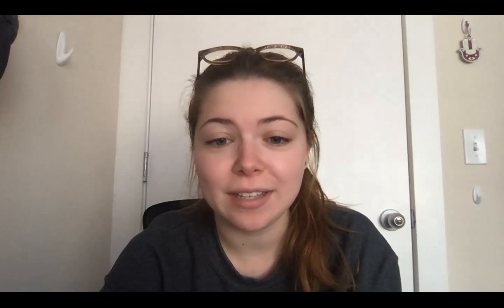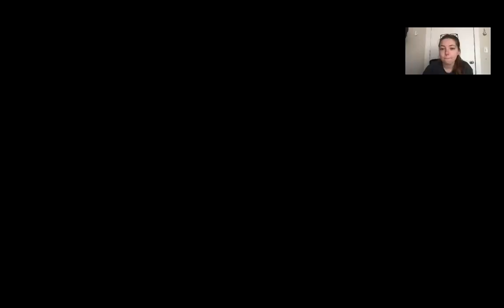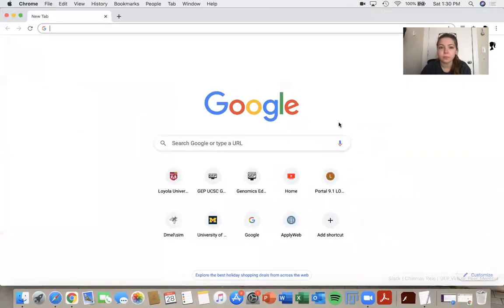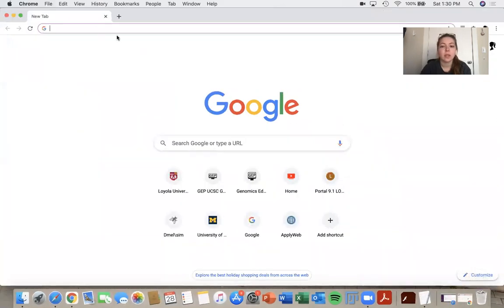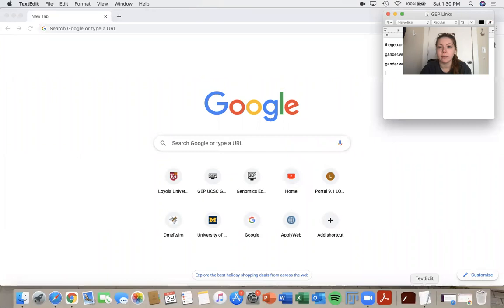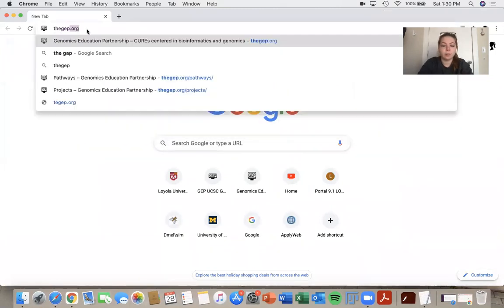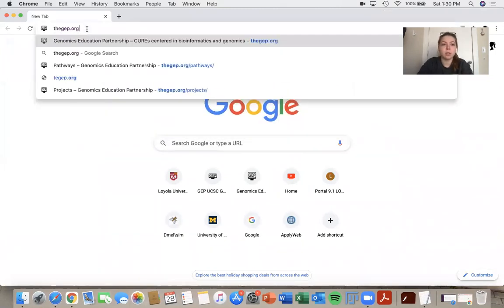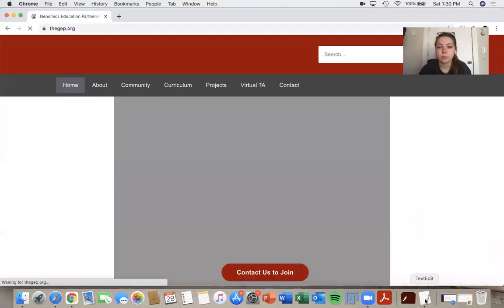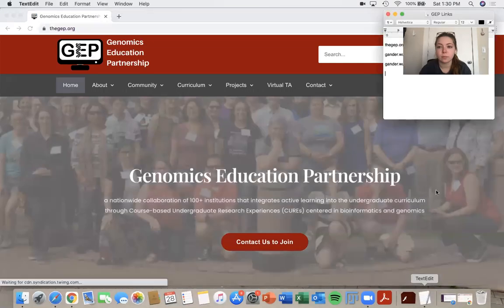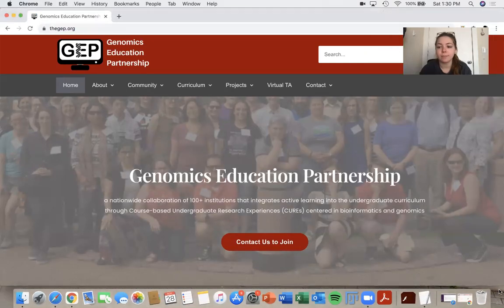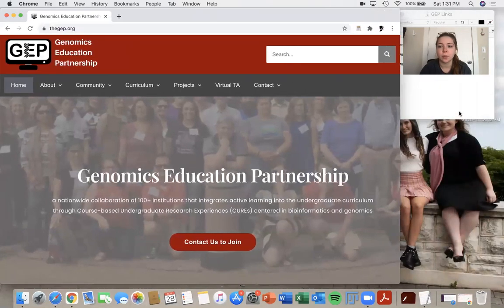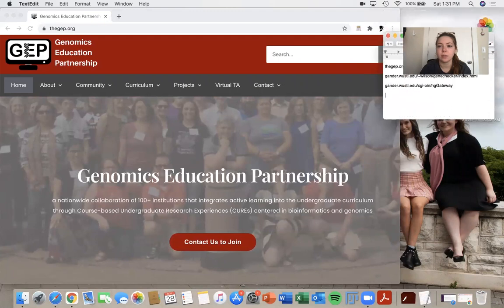So first, we're going to want to open up our browser and let me share my screen. Great. And here I have a file that has the links that I'm going to be using. Let me just pull that a little so that we can see this on the screen.